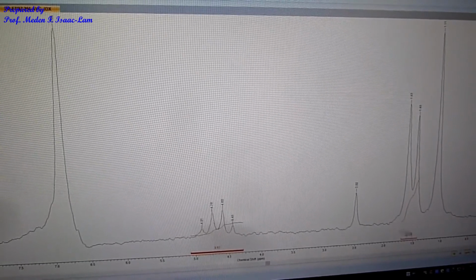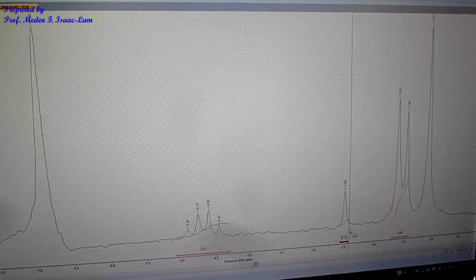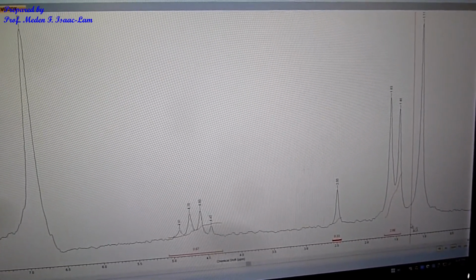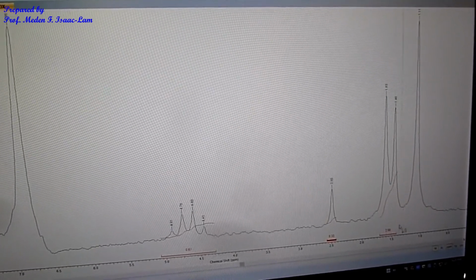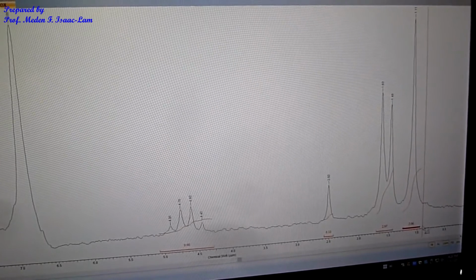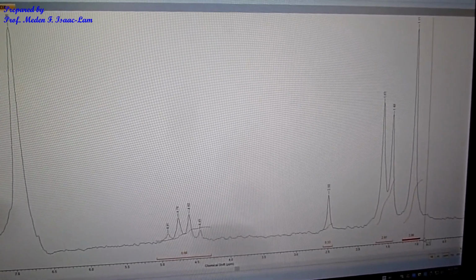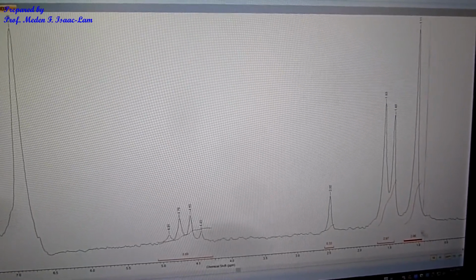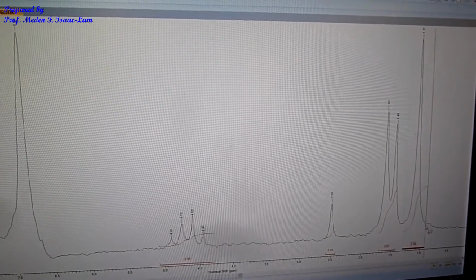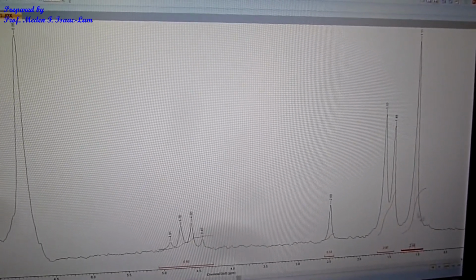And then this is going to be by itself, and that's 0.3. So that's the integration. So it's a ratio. So let me just do this part here. So that's around 3. So this is the ratio, but this is by itself.